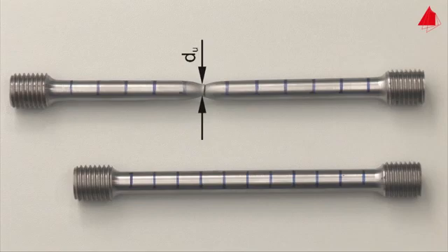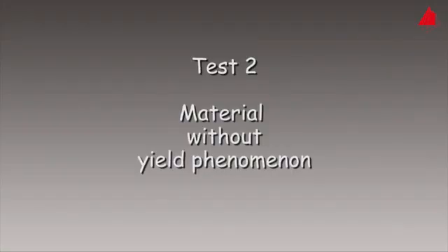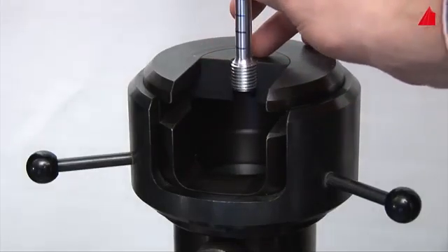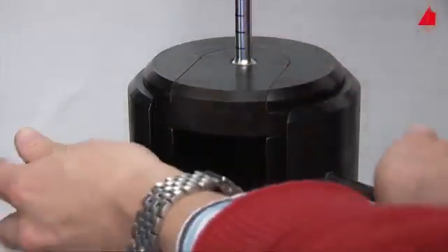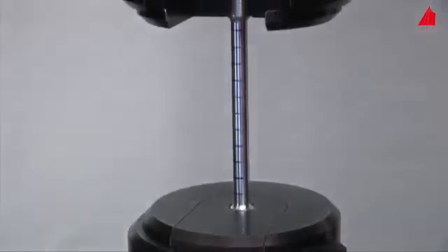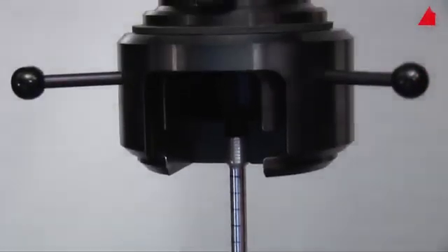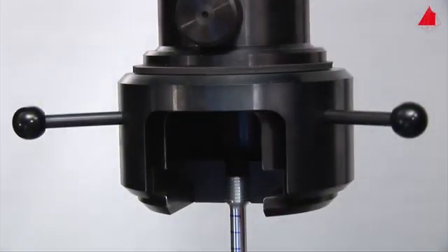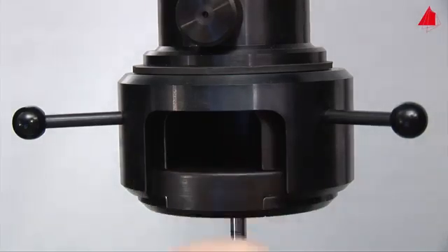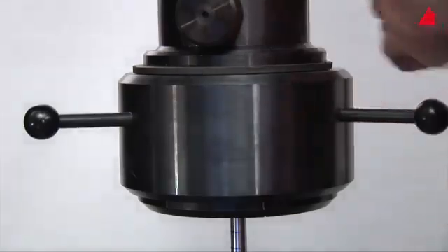In the second tensile test, a material without yield point phenomenon is to be tested. In this case, it is a precipitation-strengthened aluminum alloy. The test piece has exactly the same shape and dimensions as the specimen in the first test. It is cylindrical with an original diameter of 10 millimeters and an original gauge length of 100 millimeters.